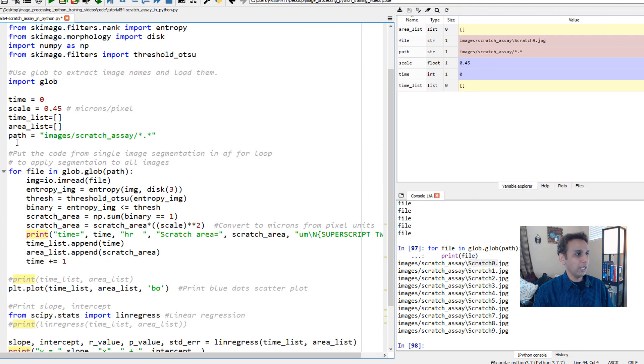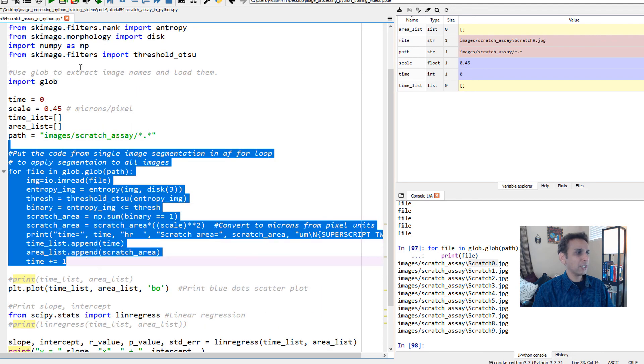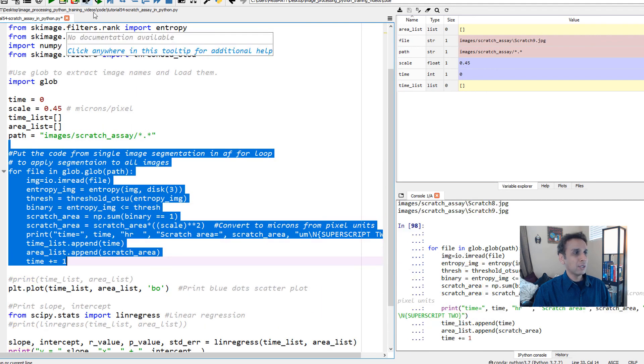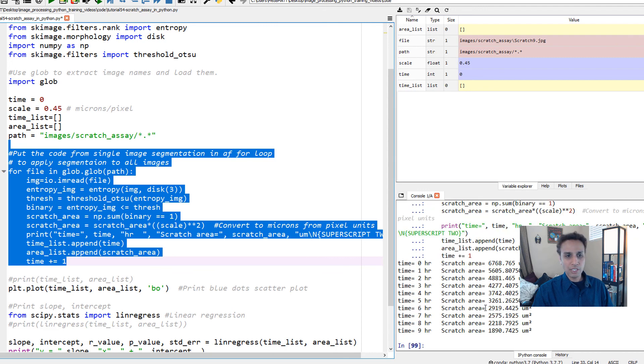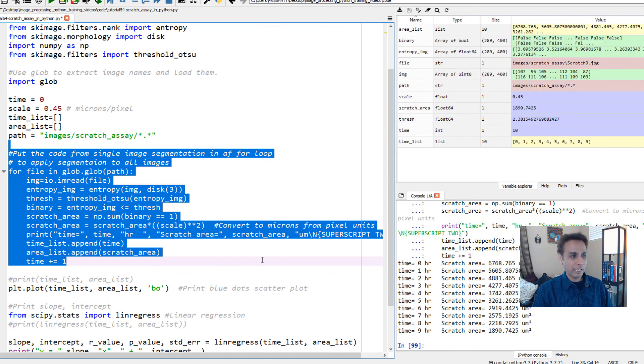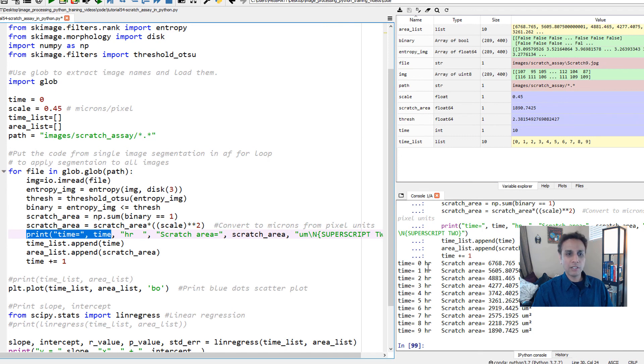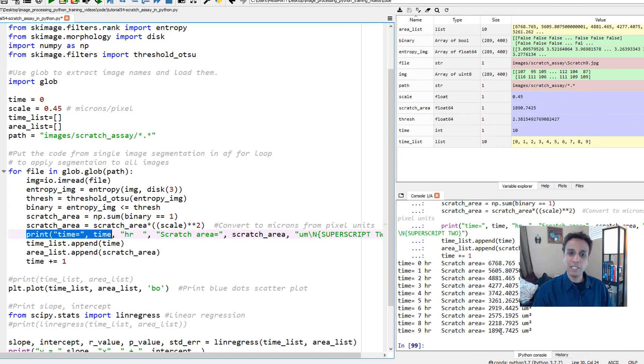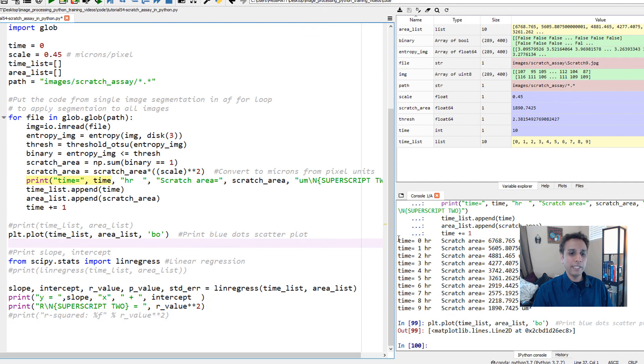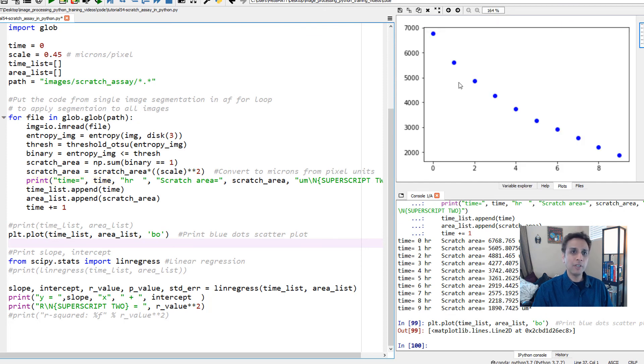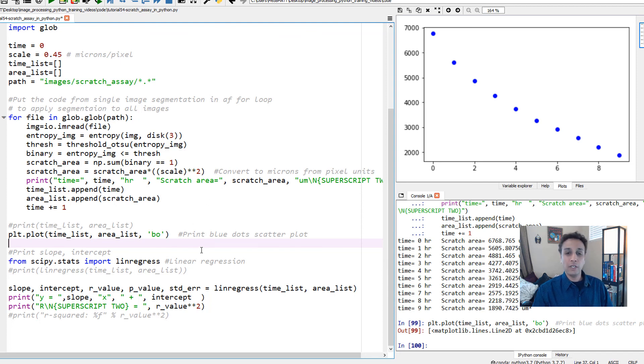Let's run these one by one. It's doing all the calculation and printing out after every step. At zero the scratch area is this and as you can see the scratch area is decreasing. These are all in square microns. When I do the plotting, you can see how it is. It's not really very linear but let's fit it to linear anyway. You can also fit it to a second order if you want.